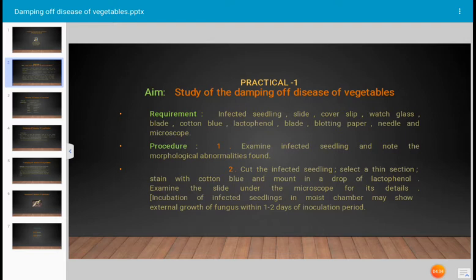Several fungi grow on that infected material, even though the medium is there. To avoid this, re-inoculate several times by removing a single thread of the pathogenic organism, and purify the culture by the single hyphal thread inoculation method. Remove a single thread and inoculate it in a newly prepared PDA plate like this. The pure culture you can observe under the microscope.